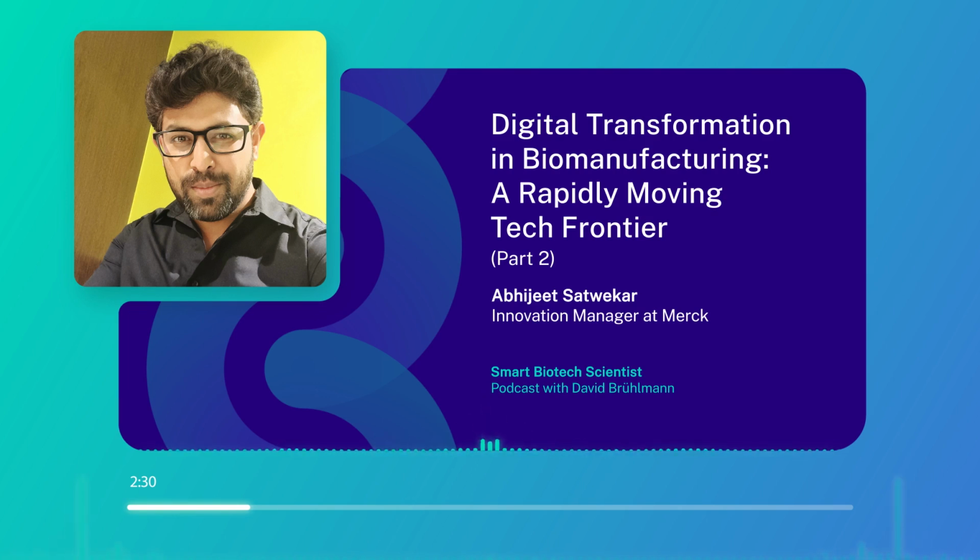Now, the PAT is really ambitious in terms of delivering the real-time release, which has been ongoing for a long time across this industry. That means how do we decrease the lead time of our QC testing and have it already tested when the product is being manufactured? And there are a lot of initiatives or projects that industries are moving around this and bring this real-time release to bring value to the patient as soon as possible. So that's also a key advantage that PAT has to offer.